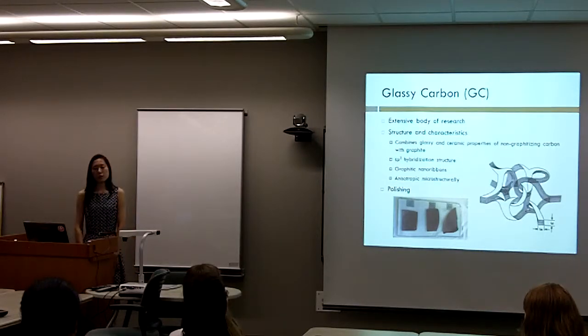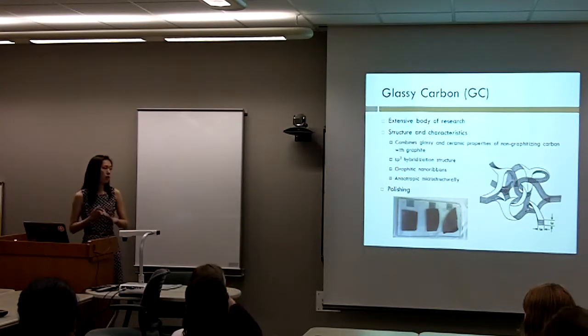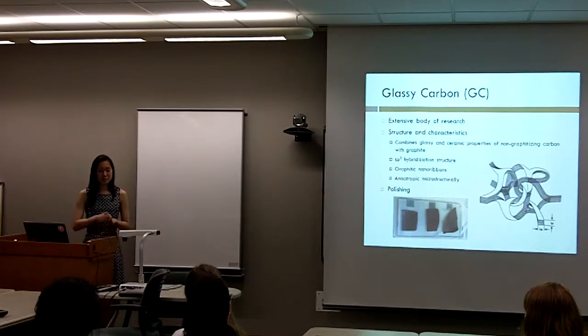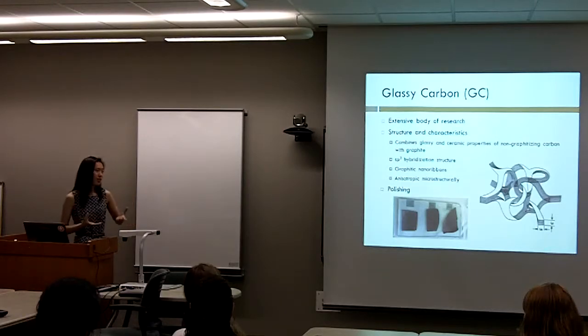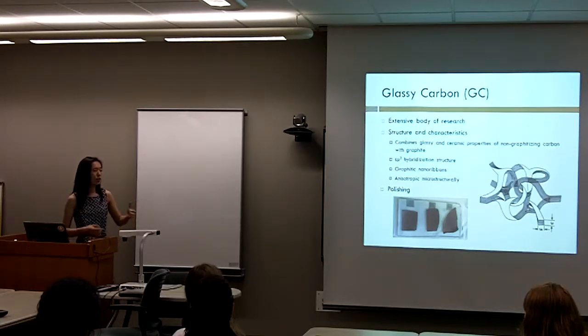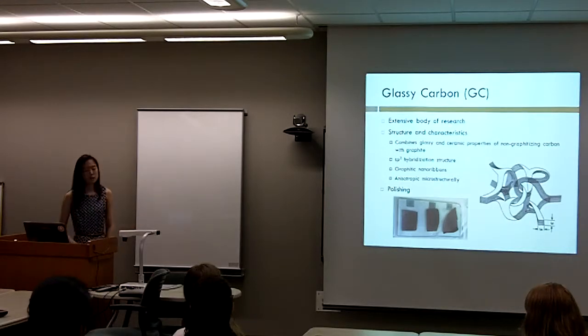After using glassy carbon a couple of times, the surface might become deactivated, so you have to polish it to remove any surface contaminants or oxidized compounds, and you remove some of the carbon to reactivate the surface. The thing about polishing is that it takes a really long time. You sit down for an hour and you make figure eights on the polishing pad, and it's very tedious, and pharmaceutical industries might not want to spend that time polishing. It's an inefficient use of their time. In addition, since you're removing layers of carbon, you would have to reevaluate the quality of the electrode. So it's pretty inefficient to use.